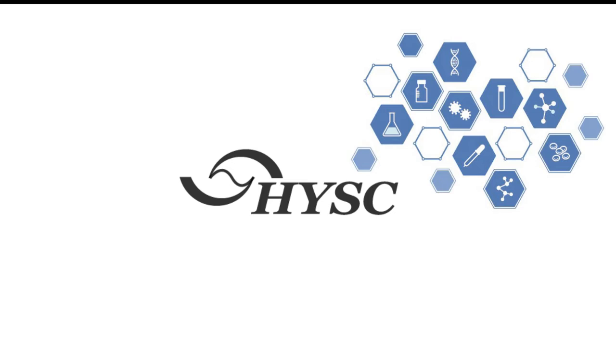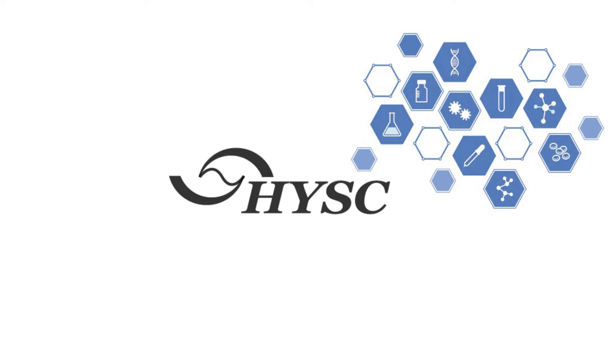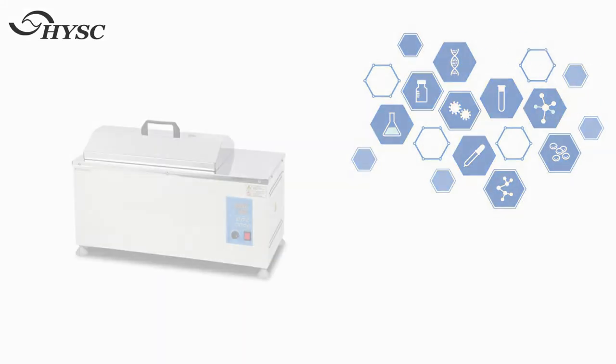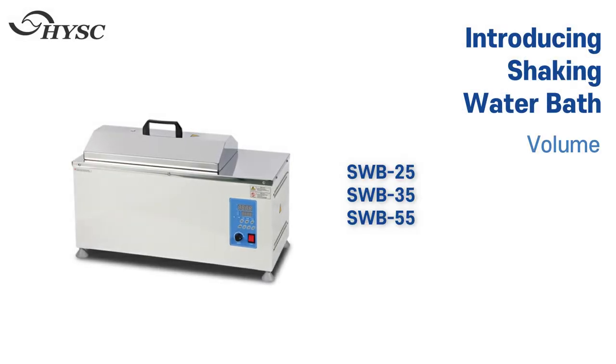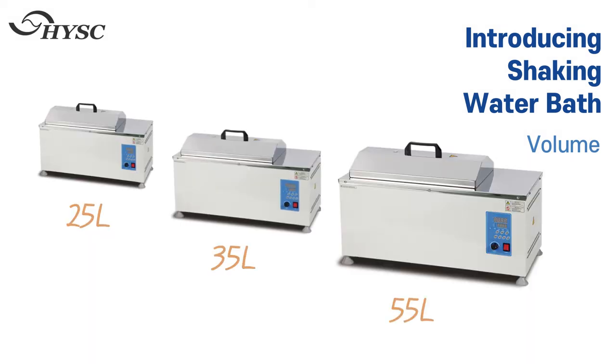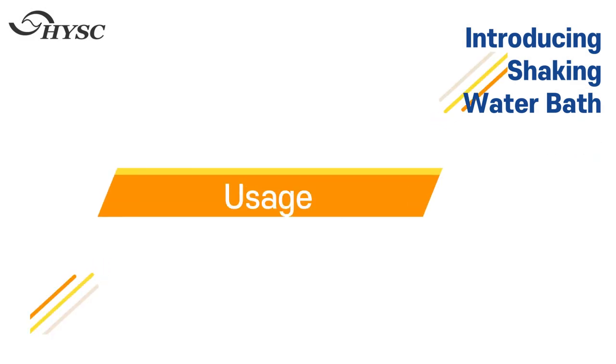Henying Science Lab is a specialized manufacturer for laboratory equipment. Introducing the Shaking Water Bath — the SWB series is divided into 25 liters, 35 liters, and 55 liters by internal capacity. Let's see how to use it.